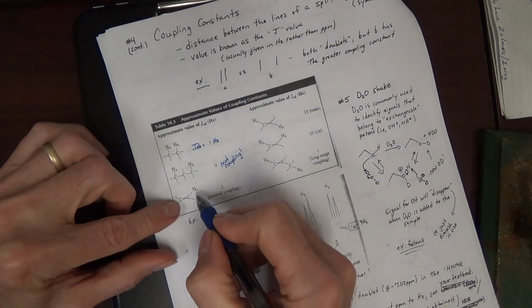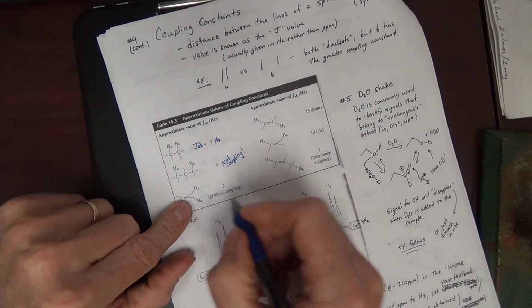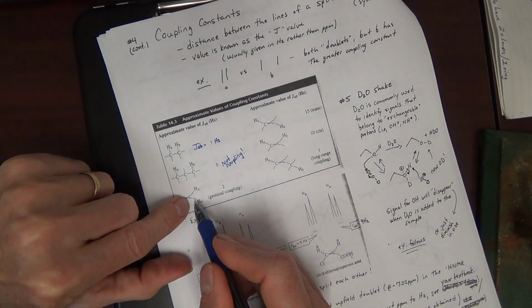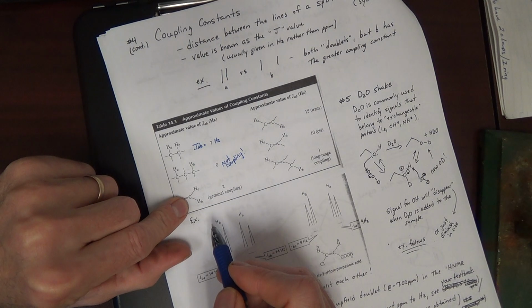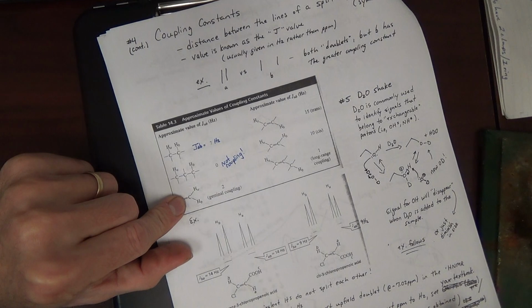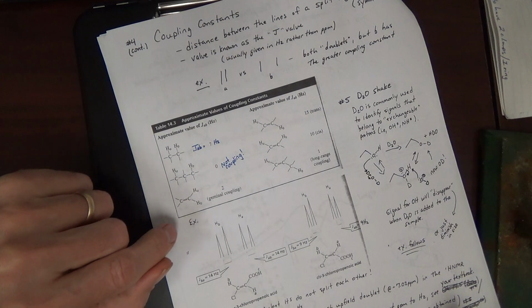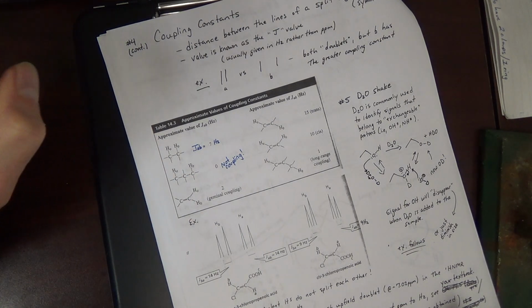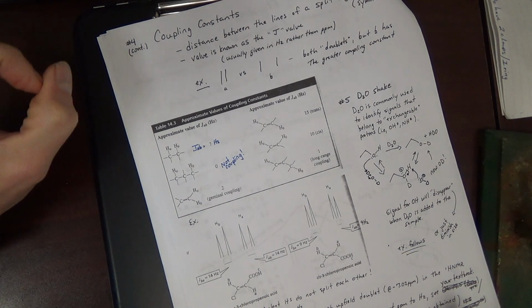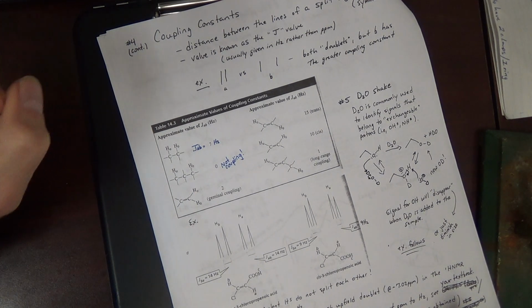Okay. 2 H's on an alkene carbon, if they're different, will be about 2 Hertz. Geminal. Geminal meaning twins. They're on the same carbon. This assumes that A and B are different. All right? If these 2 H's were the same, they would not be coupled to each other. Identical H's do not couple. They do not split each other. Because it's the same signal.